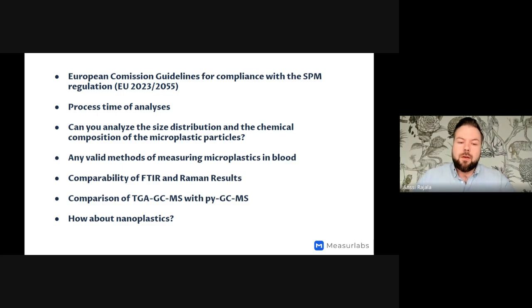So if there are any larger particles, in that case, they are much more representative in the result than the nanoplastics. There has to be quite a huge amount of nanoplastics to be basically in the result of pyrolysis GCMS, for example, but they are included in the results. But overall, nanoplastics is still a thing that is very, very challenging and very much under research and development. And there are not very many standardized methods for their analysis.